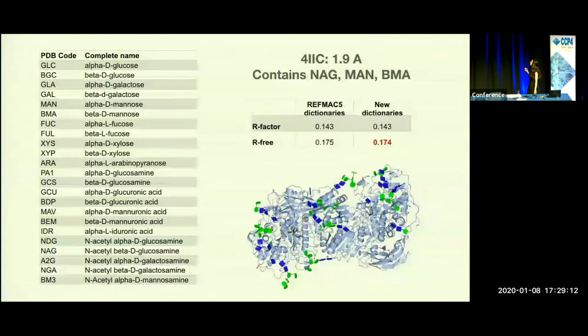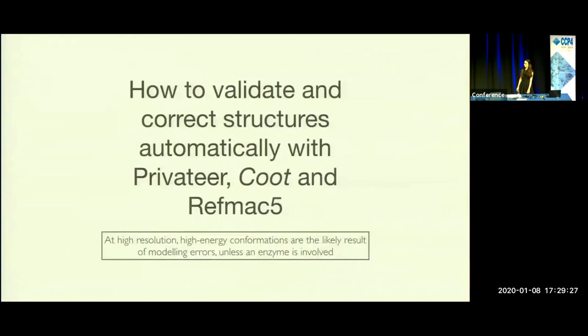These are the dictionaries we have generated so far. This is a structure refined with the new dictionaries and there is a slight improvement if you compare it to the current REFMAC dictionaries and the new ones that I generated. Now I'm going to show you how to correct structures automatically with Privateer, COOT, and REFMAC. First, I'm going to show you a high resolution structure where conformations are likely the result of modeling errors unless an enzyme is involved.